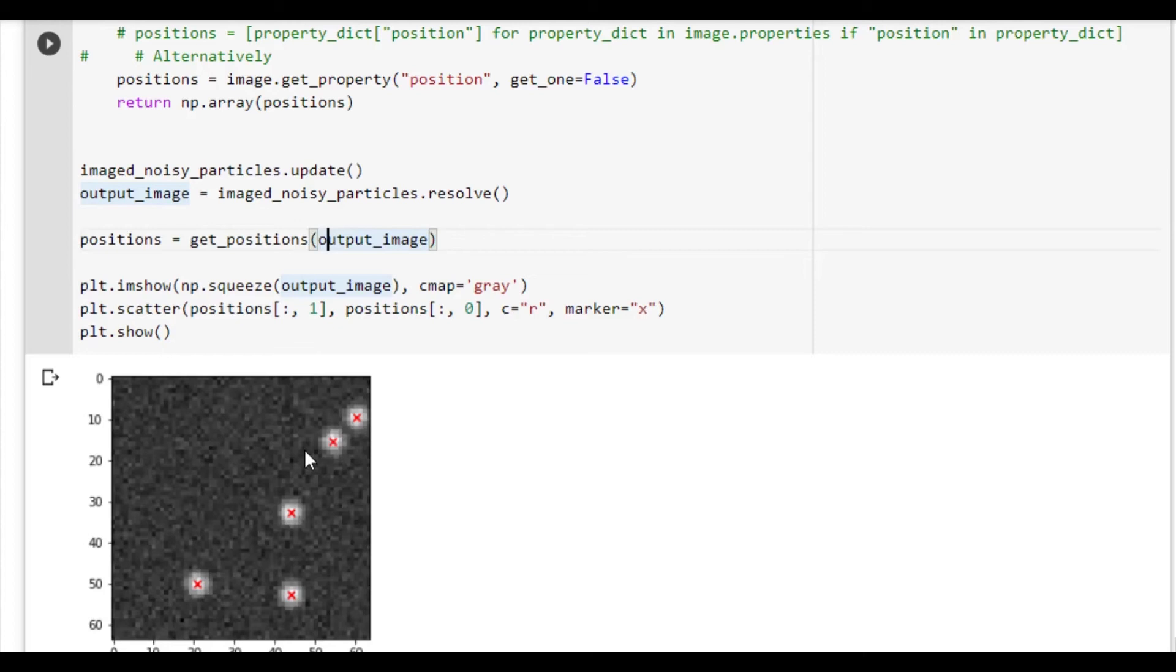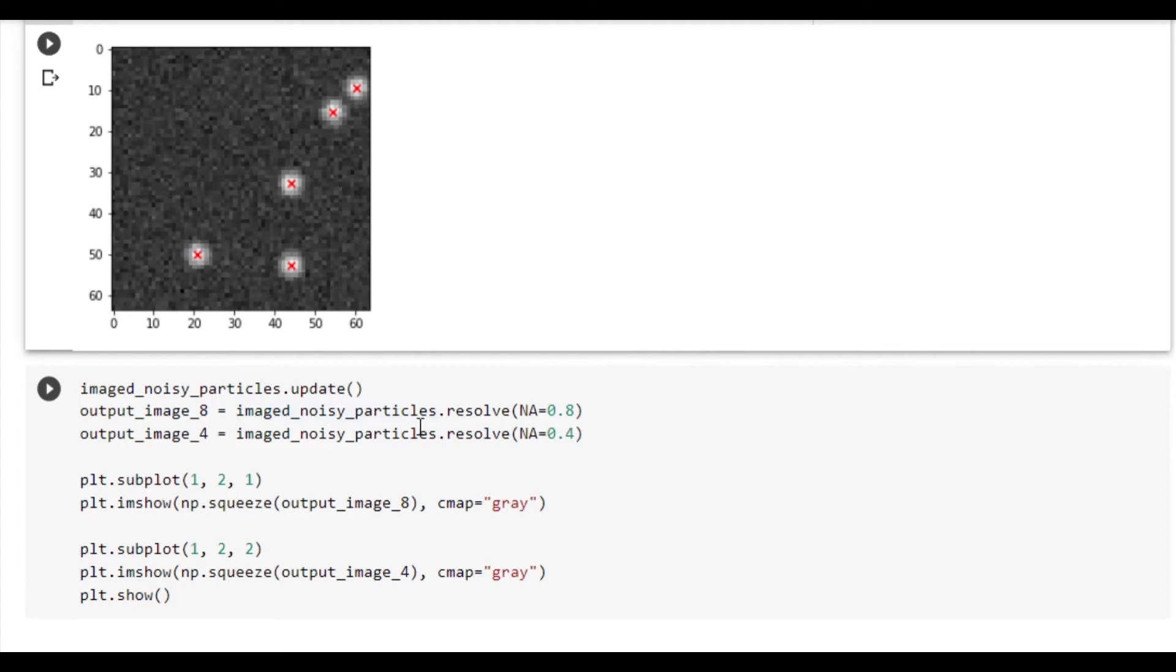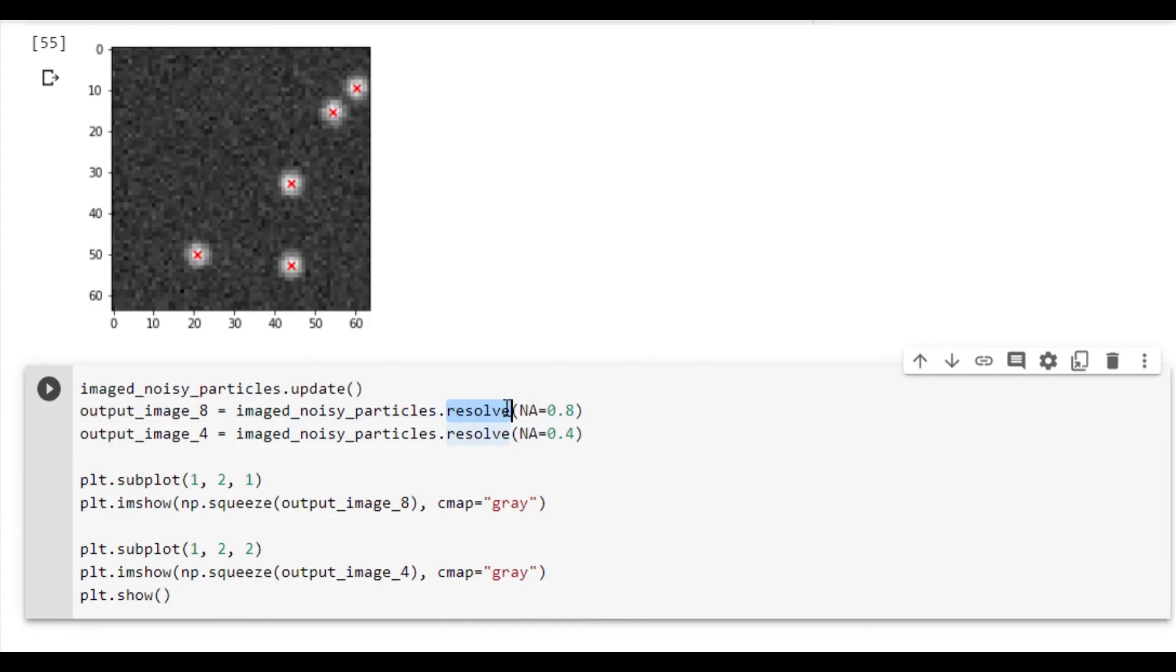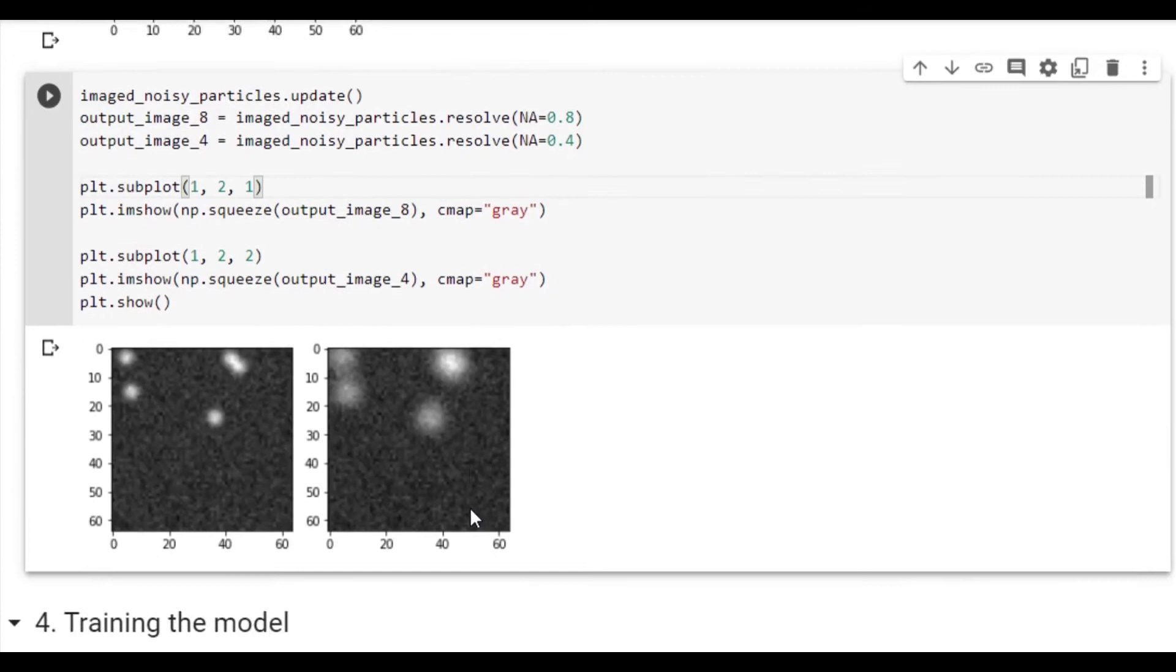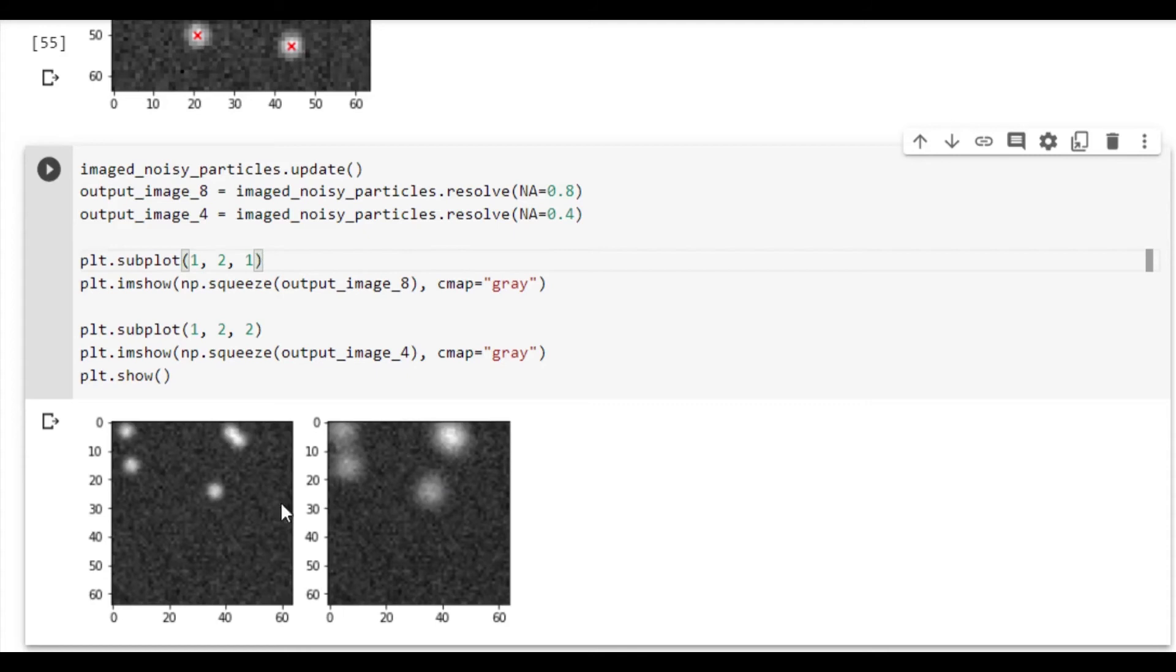This is a very powerful way to extract a ground truth label for the network to train on. There is also a second way to extract a label, which we will very briefly touch upon here. You can optionally pass keyword parameters to the method Resolve. These override any arguments you've passed to individual features. For example, here we override the NA or the numerical aperture. We first resolve an image with an NA of 0.8, then we resolve the same image but with an NA of 0.4. As you can see, the second image has a much larger point spread function as you would expect. With this syntax you can for example train a network to remove noise, optical aberrations, or to re-propagate particles to the focal plane.